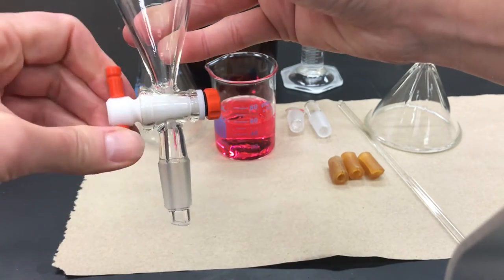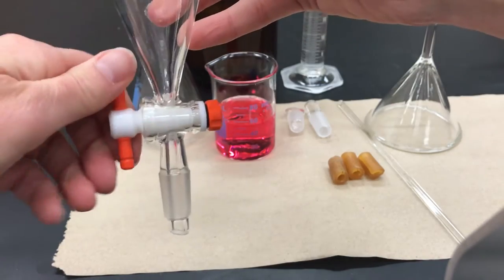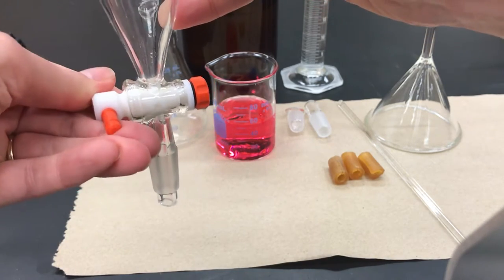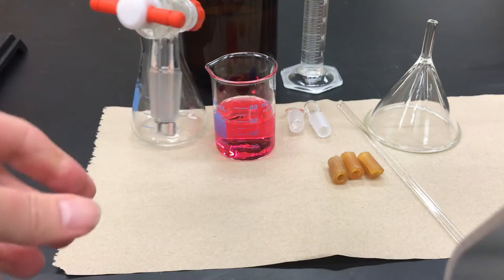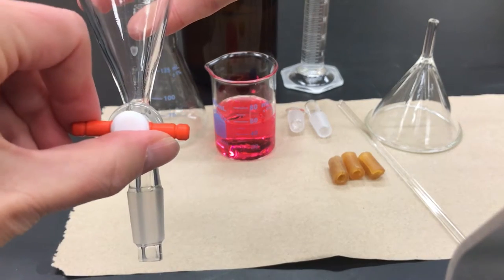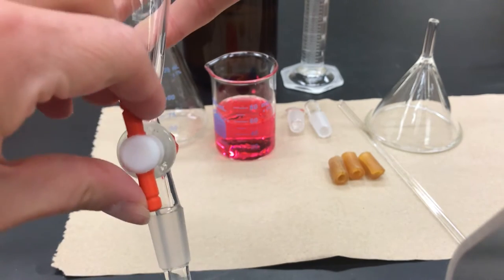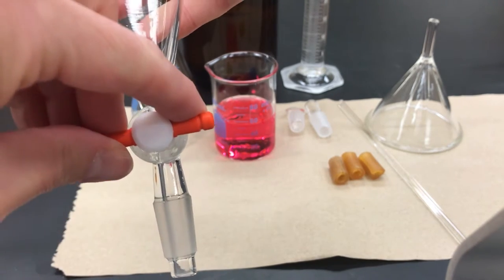You can open the stopcock a few times just to make sure — it shouldn't be really loose, and it shouldn't be impossible to twist either, but it should have some resistance. These stopcocks are closed when they're in the horizontal position; when they are vertical they're open and liquid can drain, so make sure they start in the closed position.